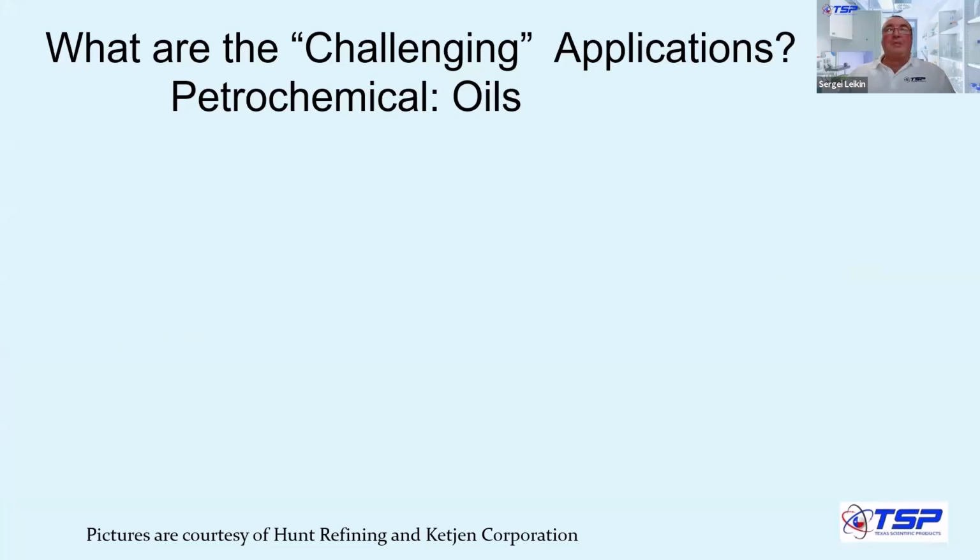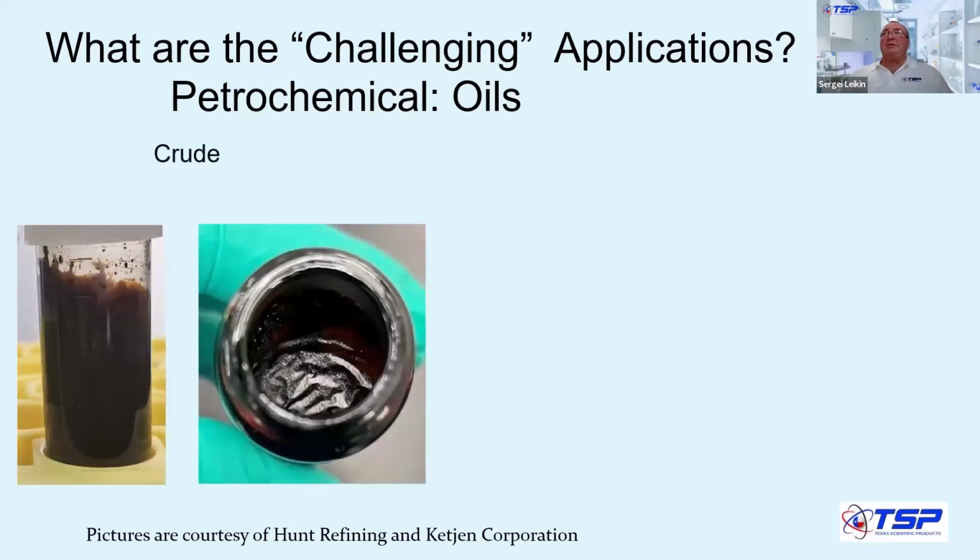The first challenging application is oils. There are different types of oils. If you run lubricating oils, or maybe some wear metals in used oils, it could be challenging. But the most challenging are some of these that you can see on the picture that was shared by some of our customers.